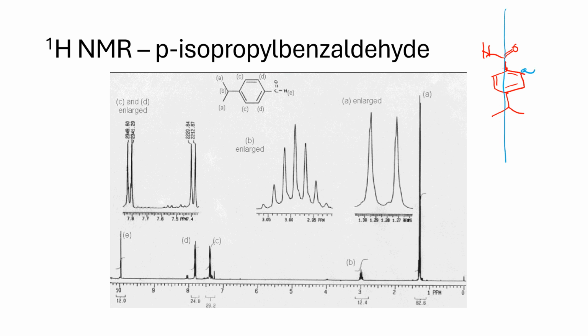So this proton is the same as that, and then you have B. What it says is that we have 2 types of H's in the aromatic region. And not only that, A couples to B, so that's a doublet, and B couples to A. So 2 doublets. This pattern is characteristic of a disubstituted benzene ring.